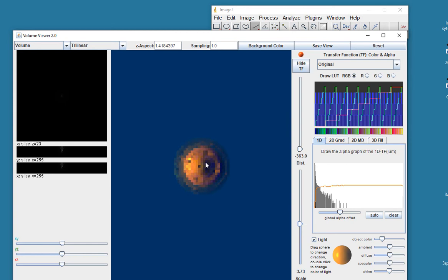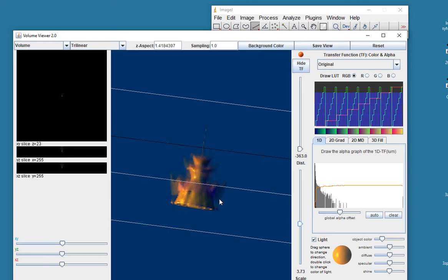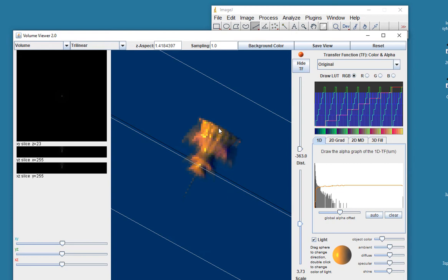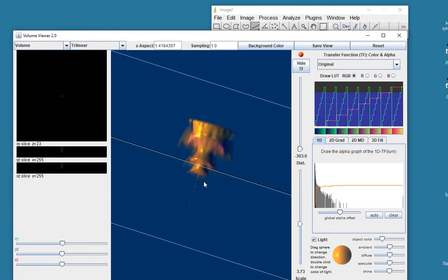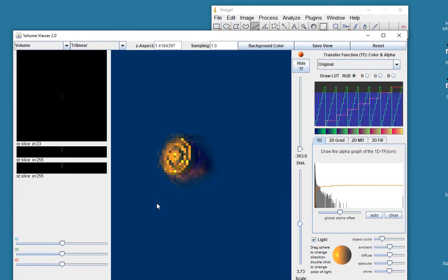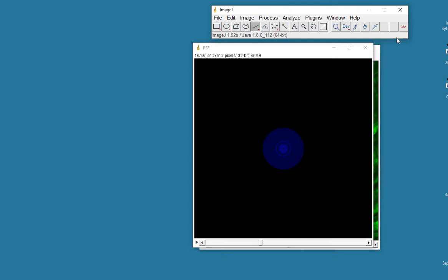Switch the light on. I'm going to zoom up a little bit. So here we are, there's our point spread function, a bizarre looking little thing. I often wonder about the shape of this, and I suspect it might be that it's only showing you half of the point spread function, and it's assuming that this would be a symmetrical object. It generally looks like an hourglass shape, so I'm guessing here because I'm not entirely sure how the algorithm works, but I suspect that the point of light source is here, and that this would be replicated here to give you a sort of hourglass shaped function.